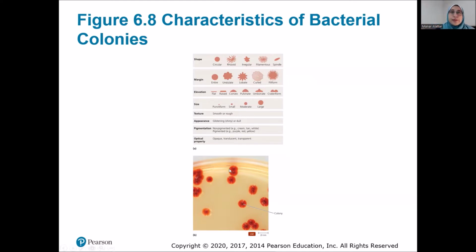And so here you can see individual colonies growing on what's likely a TSA plate, which is just a general growth media. And colonies will have different morphologies, which you interacted with in lab as well. The shape of the colony, on top of the shape, also the shape of the margins of the colony. How the elevation of that colony is will kind of be dictated based on how those organisms grow within community, the size of the colony, and then texture and 3D appearance of that colony, as well as color and transparency.